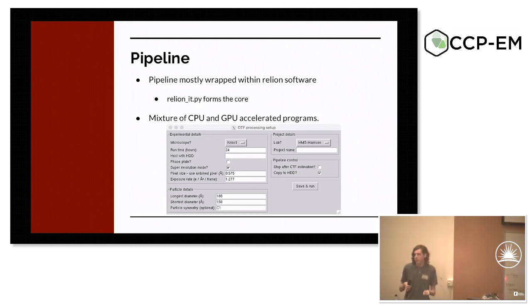At this point, I really have to stop to thank Sjors and his team, as well as CCP-EM, for developing this. You might notice the GUI I'm showing is a little different from the one that Colin and others have shown, largely because it's written in Python and explicitly made for this. I've taken it and modified it, taken out the parts that didn't work for our setup, added in new modules, and changed the way we pick particles, for example.